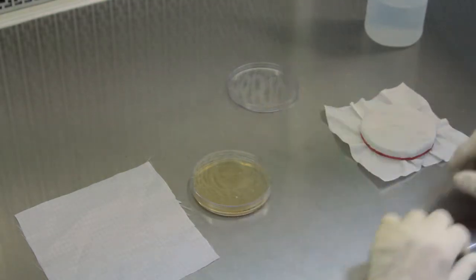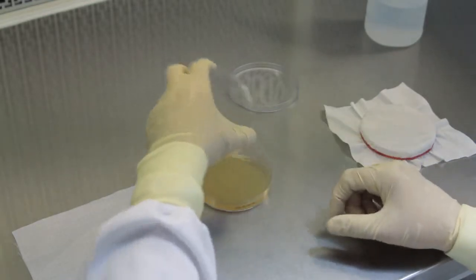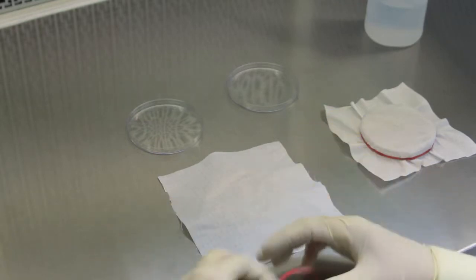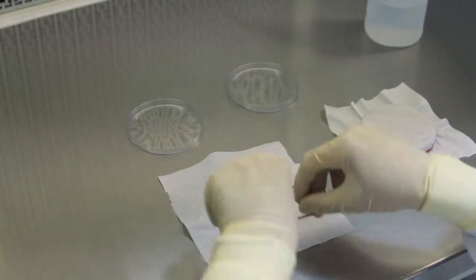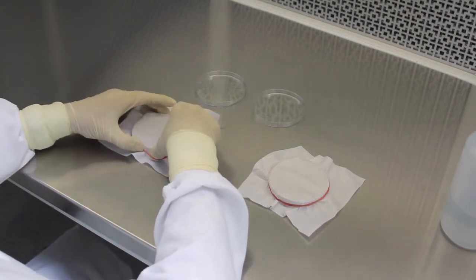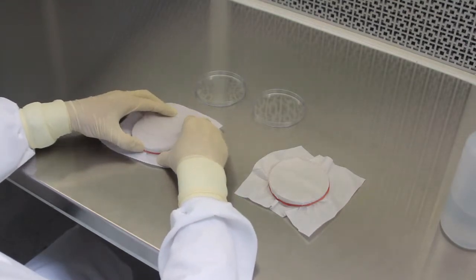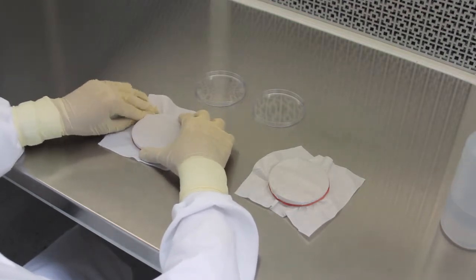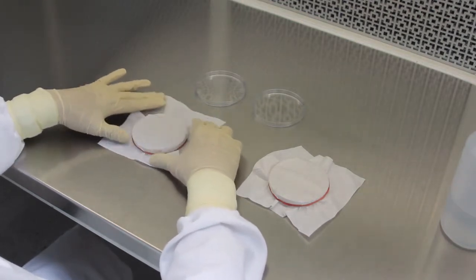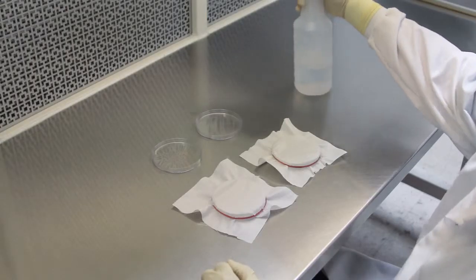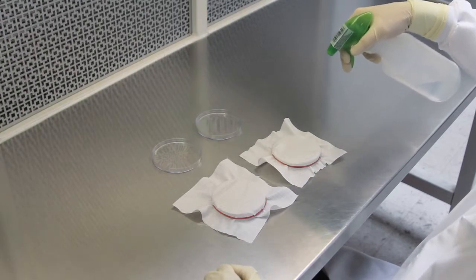In a horizontal laminar flow hood, the lab technician places a piece of fabric over the top of a petri dish containing nutrient agar. He then fastens the fabric to the petri dish using a rubber band. The fabric sample does not touch the surface of the agar. Next, he sprays a small amount of liquid containing bacteria from a squirt bottle onto the fabric and lets the plate sit for 24 hours.